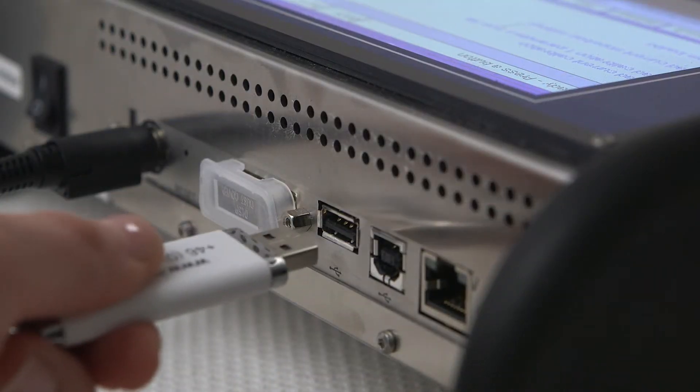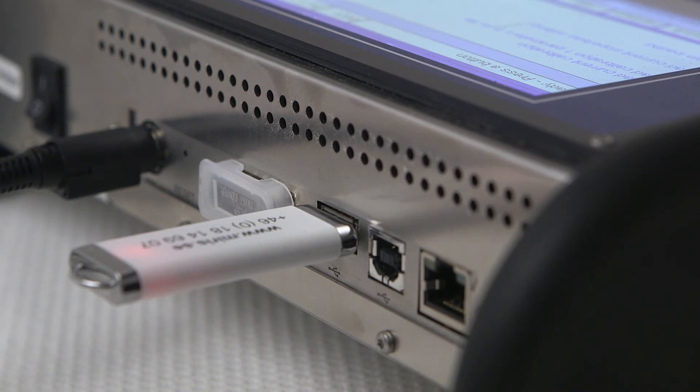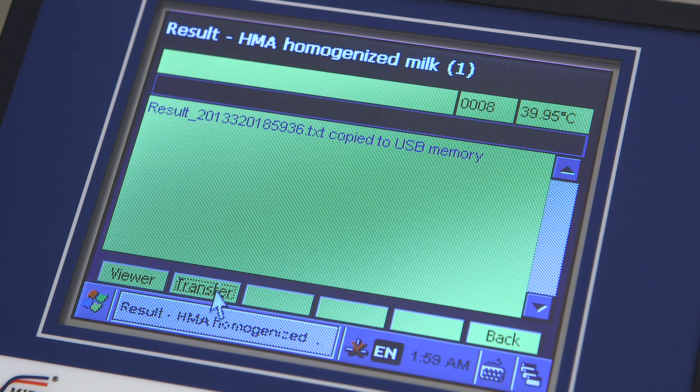Your results can be quickly transferred to a USB as a text file for presentation in a spreadsheet by pressing Result and then Transfer on the menu bar.